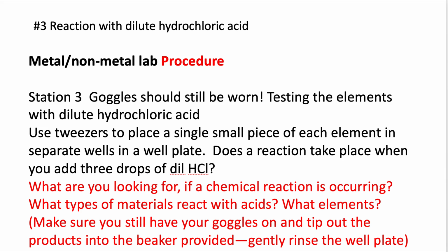Then we're going on to station 3, reaction with dilute hydrochloric acid. Still keep your goggles on, and indeed gloves. Use tweezers to place a single piece of each element in separate wells in a well plate. And when you add the 3 drops of dilute acid, does a reaction take place?